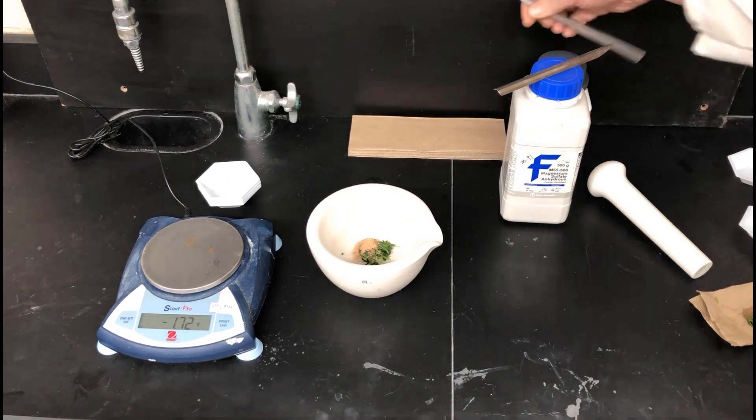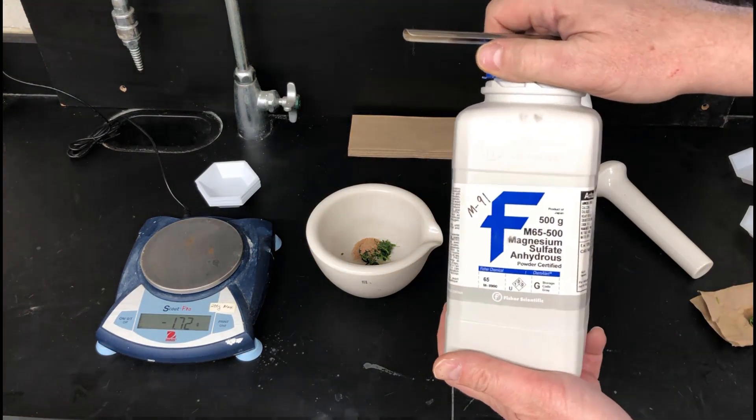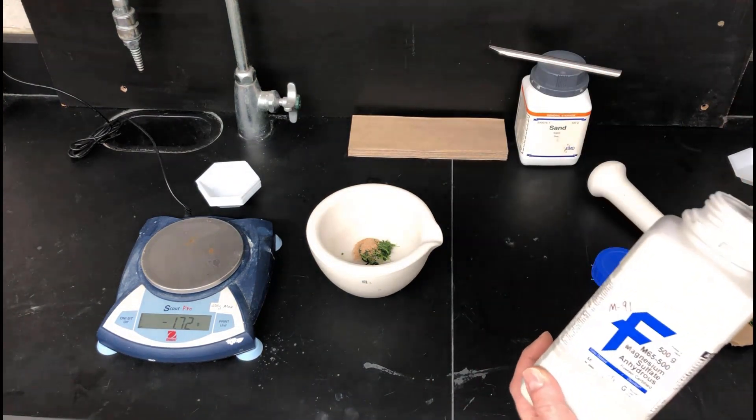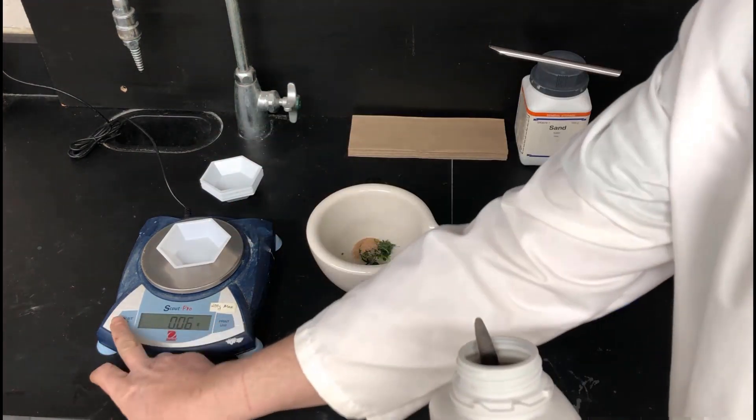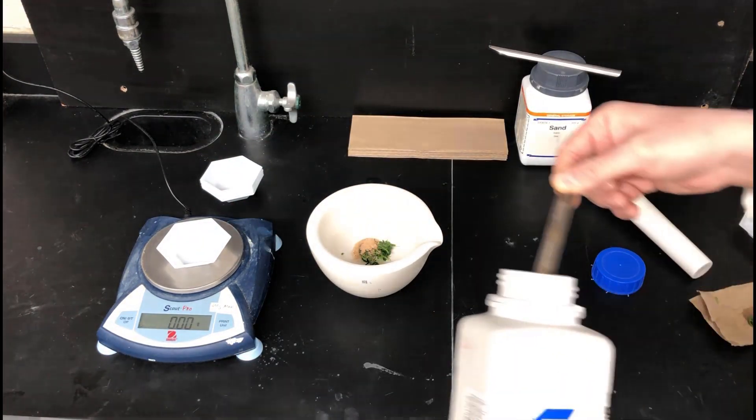Next I'm going to measure out some magnesium sulfate. So this magnesium sulfate is a drying agent. This is anhydrous magnesium sulfate, so it absorbs water and grabs onto water pretty tightly.